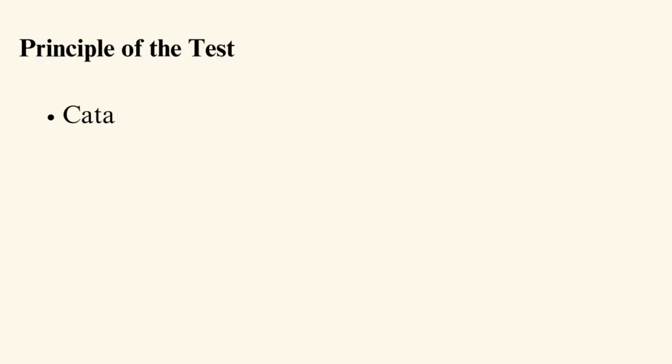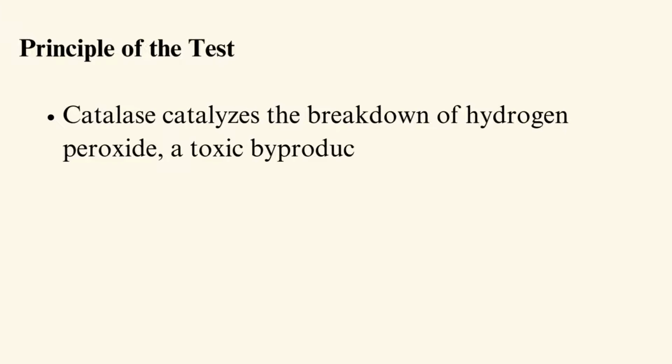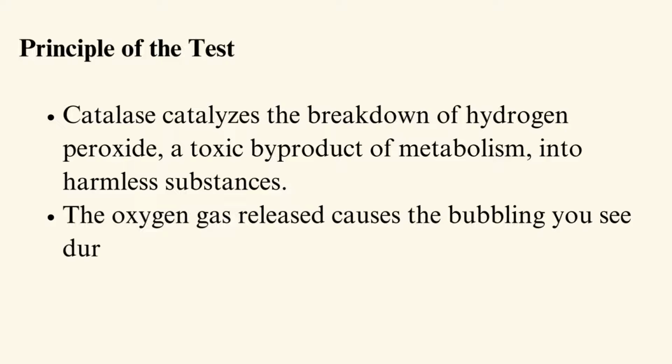Principle of the test: catalase catalyzes the breakdown of hydrogen peroxide, a toxic byproduct of metabolism, into harmless substances. The oxygen gas released causes the bubbling you see during the test.